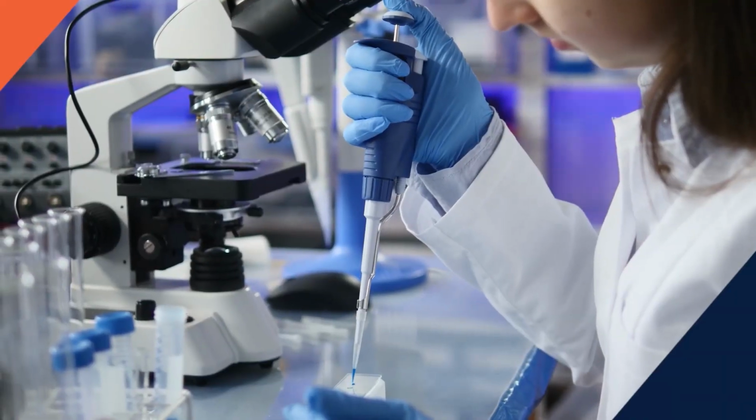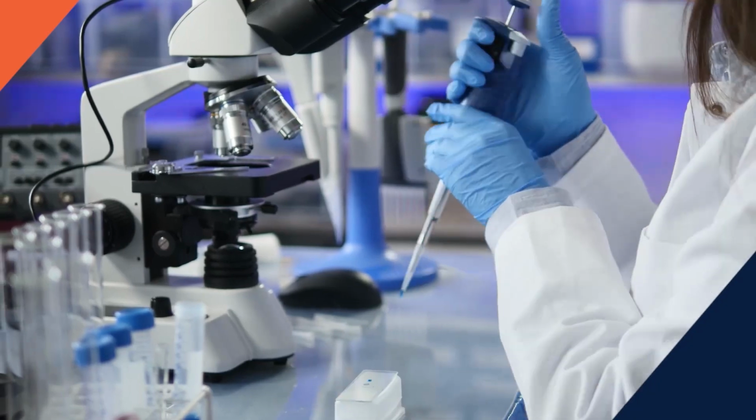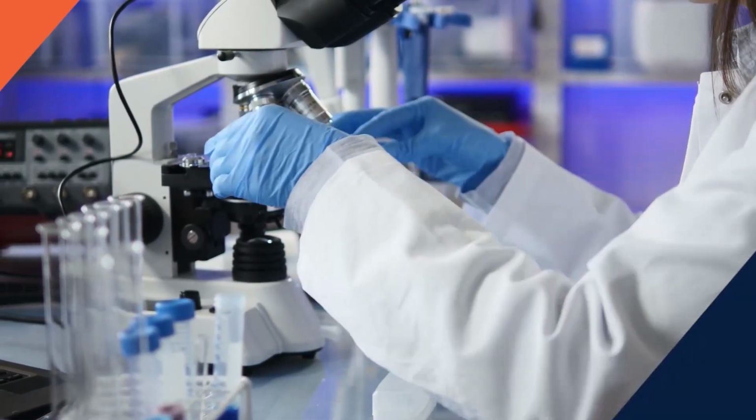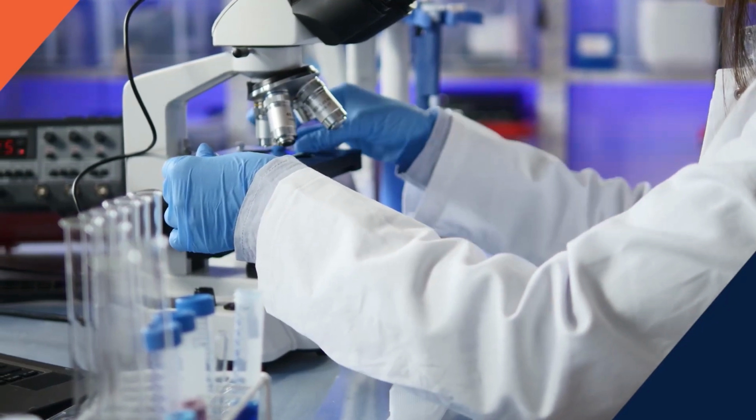Using your knowledge manager, you run your process and you configure your instruments and you collect data from all your instruments. And when you're at a stable sampling point as dictated by your DOE software, you gather all the spectral and univariate data, and you also take a physical sample from your process at the strategic point that is representative of the process. So using your PAT Knowledge Manager, you select data sets and export those to your MVA package.